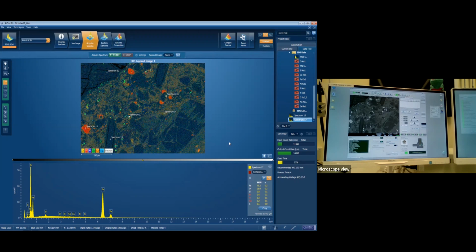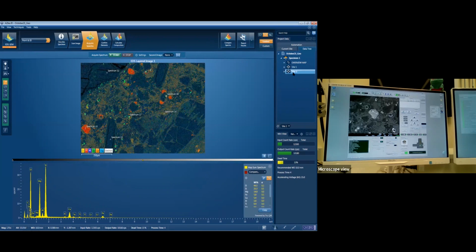I think that's all the major things on this particular thing. So we found that this little chunk down here was a little bit weird. There's a bit of a weird composition, a little bit of a weird color happening. So I think we'll do a big zoom in version of that. Because of course these are electron microscopes. That means that we can analyze things up to like 1 million times magnification if you really want to.